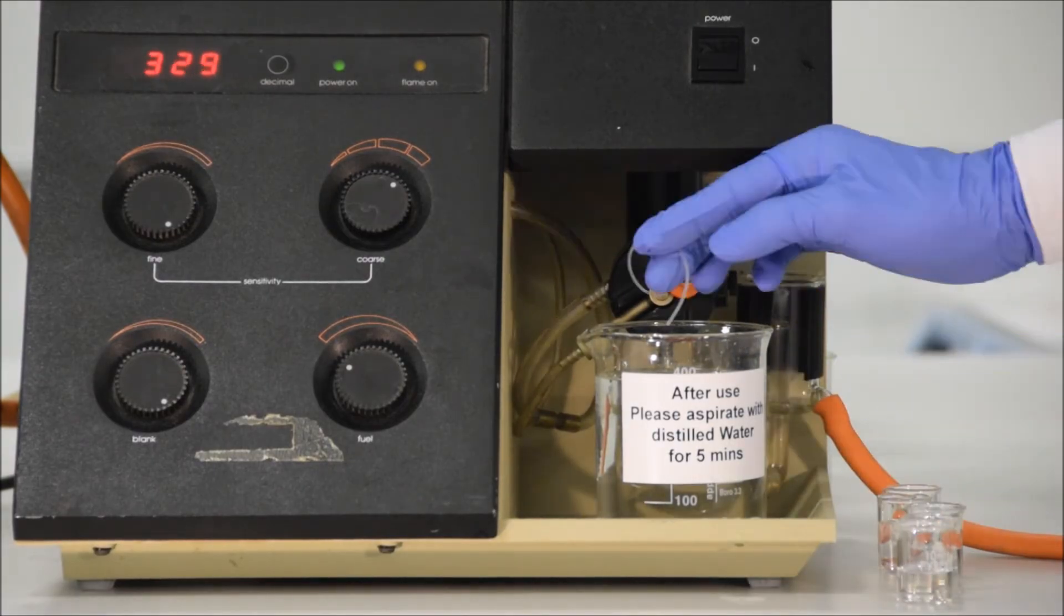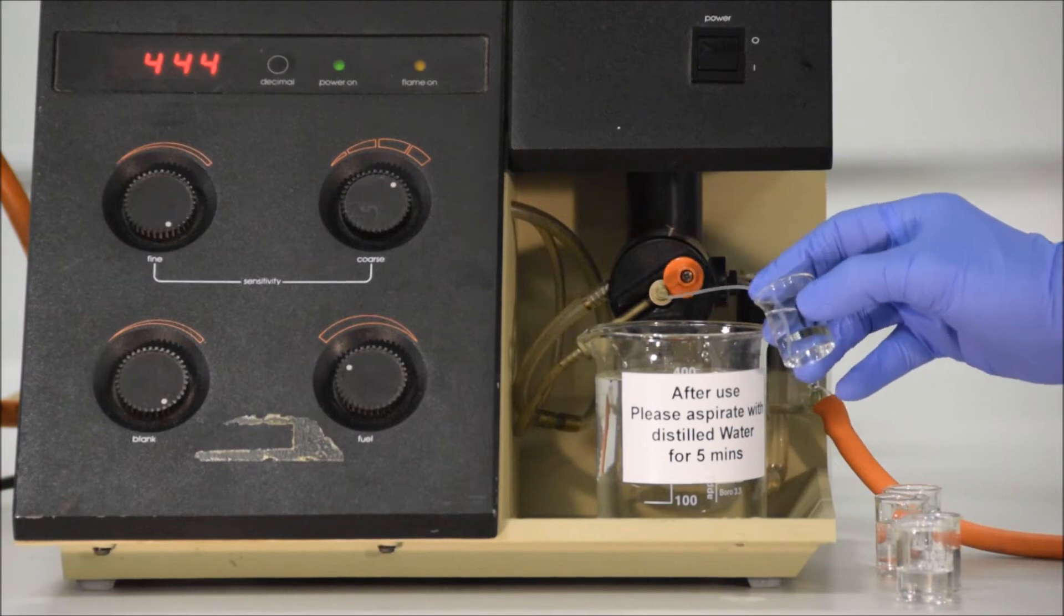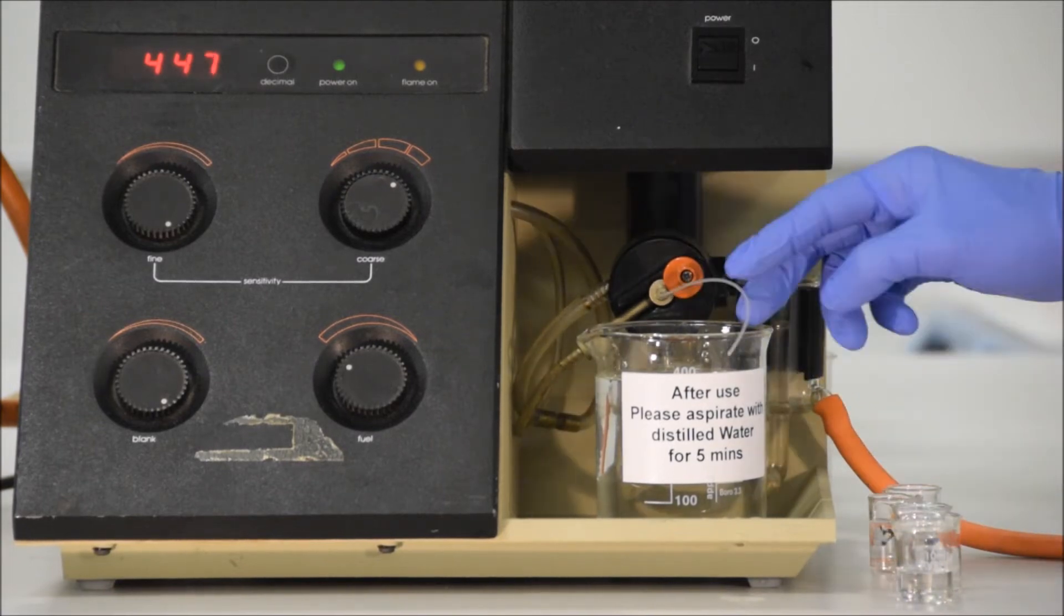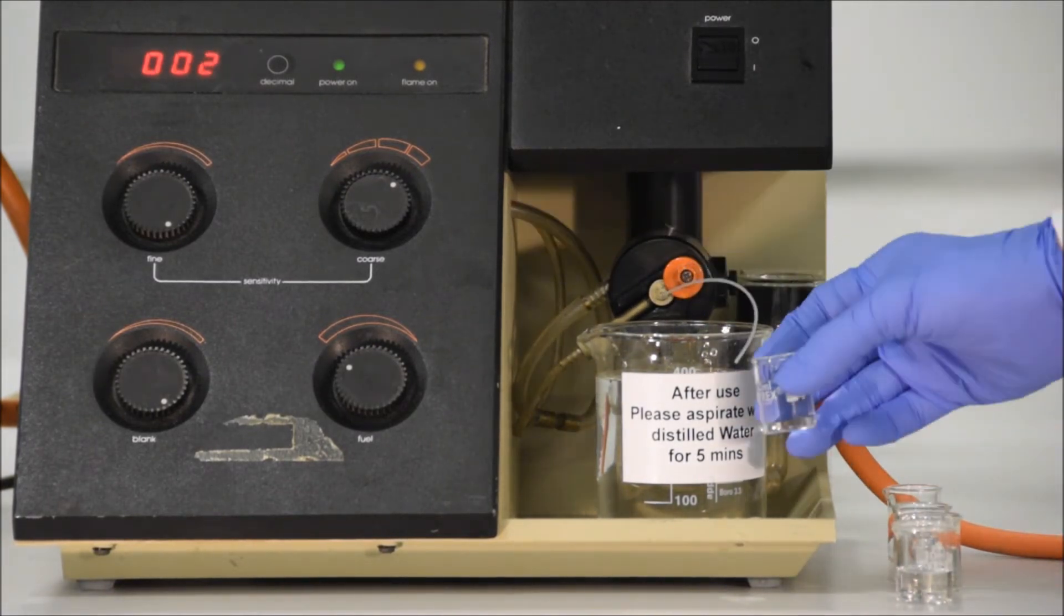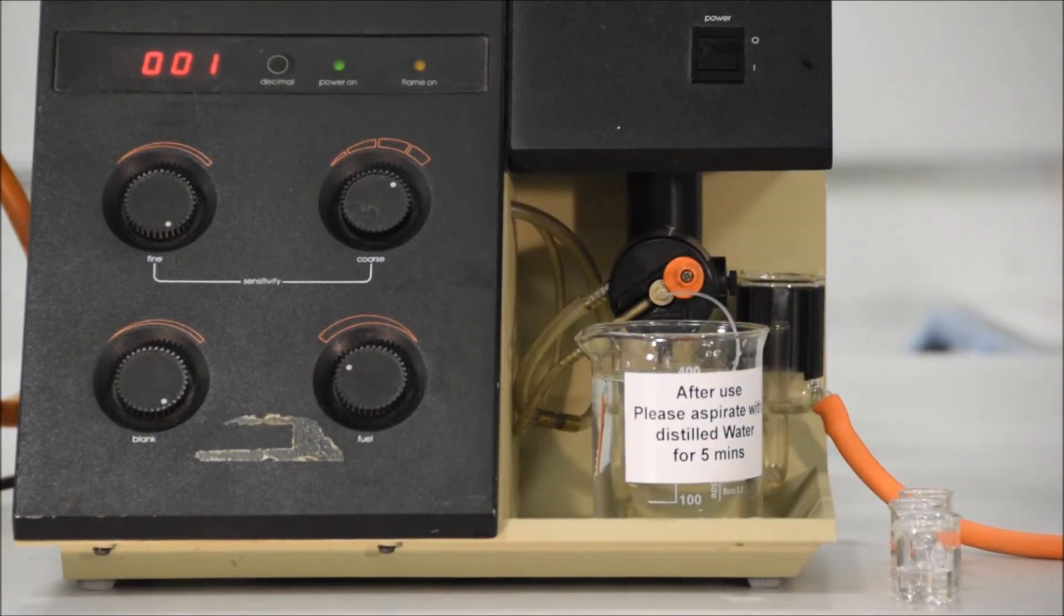Now let's make readings for all the other standards that we have. We put the inlet tube into the sample, wait 20 to 30 seconds until our reading is consistent, record that reading, and return it to the water. Aspirate for 20 to 30 seconds until it's gone back to zero, and repeat.